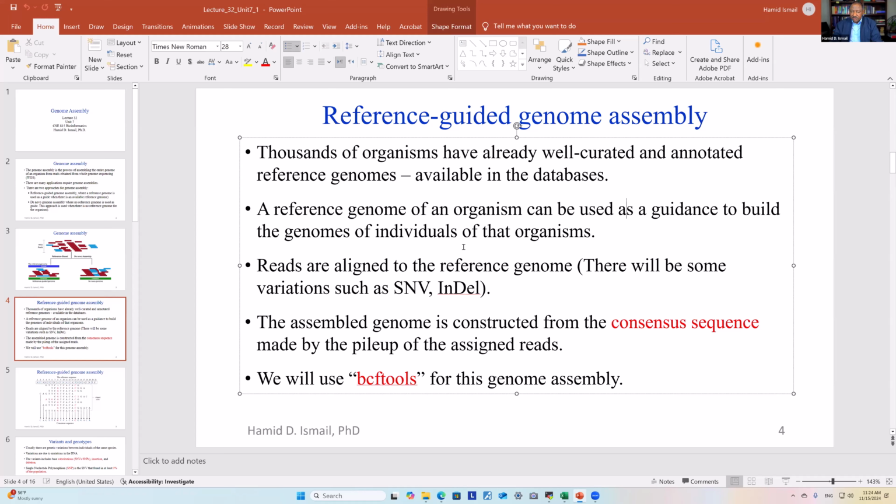So that means one substitution. And when we compute that, of course some people may have that variant, and some people don't. But anyway, we find it, so we can determine the frequency.